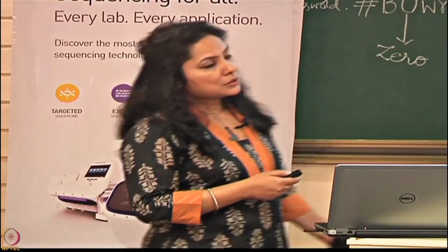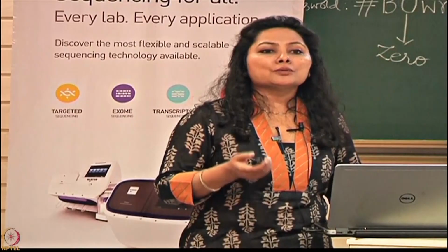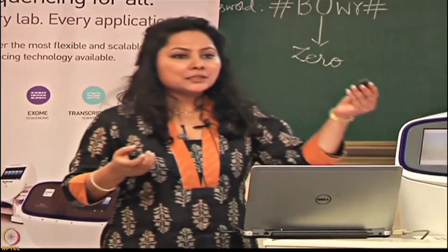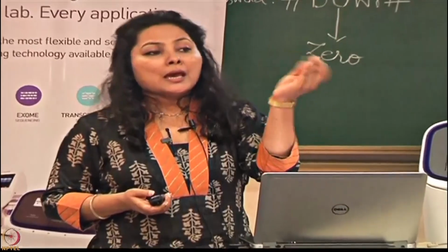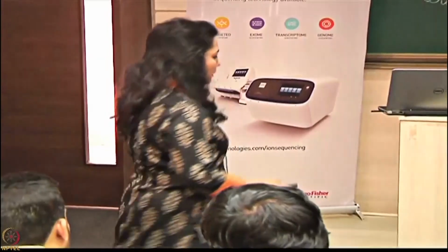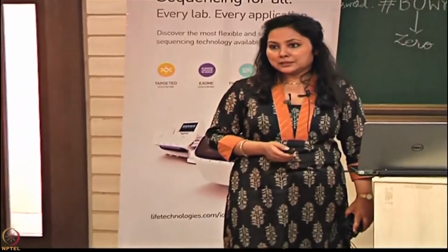Coming to next generation sequencing. As I mentioned, this is a technology wherein you have millions of wells. These are the chips which are used with Ion technology, and you have millions of wells on these chips. Each well has a sequence, and that is how you are generating millions of sequences in a run.